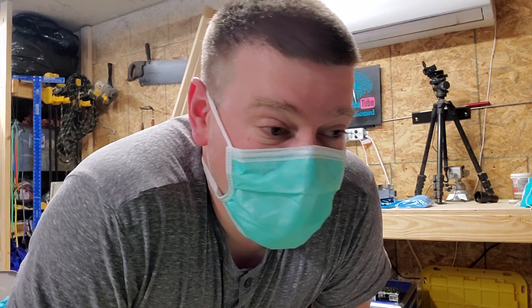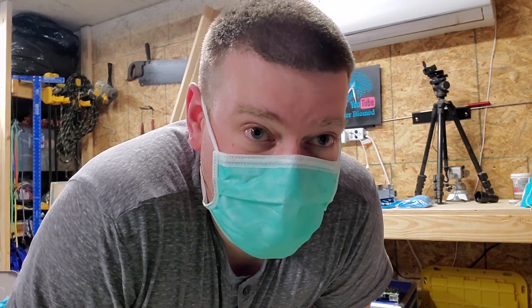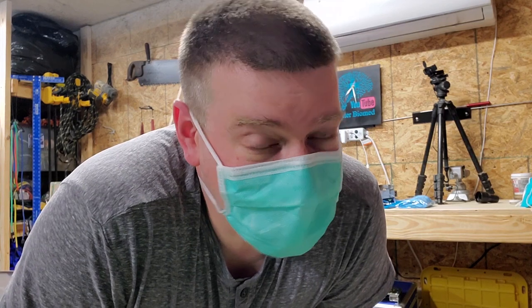Guys, that is the proper way to don and doff PPE. I know there's a little bit here and there that you might change, but that's the general process. The most important thing is to hand sanitize between every stage, and don't touch your face, especially around the eyes.